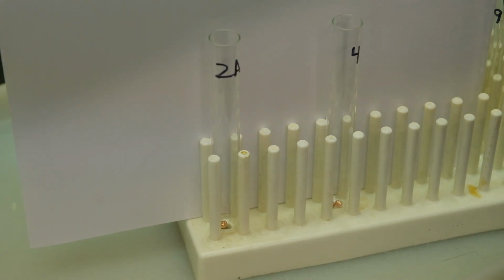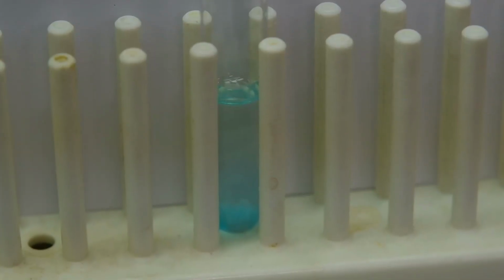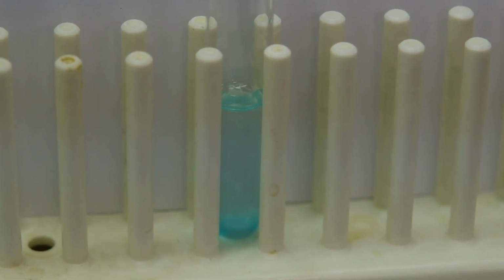Record the observations over the course of 5 minutes. After 5 minutes, these are the observations you can see on system 1.